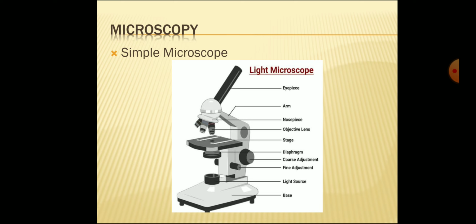In contrast to a telescope, a microscope must gather light from a small area of a thin, well illuminated specimen that is close by. So, a microscope does not need a large objective lens, and so it is small and spherical. It has a much shorter focal length on either side. It brings the image of the object into focus at a shorter distance within the microscope's tube.